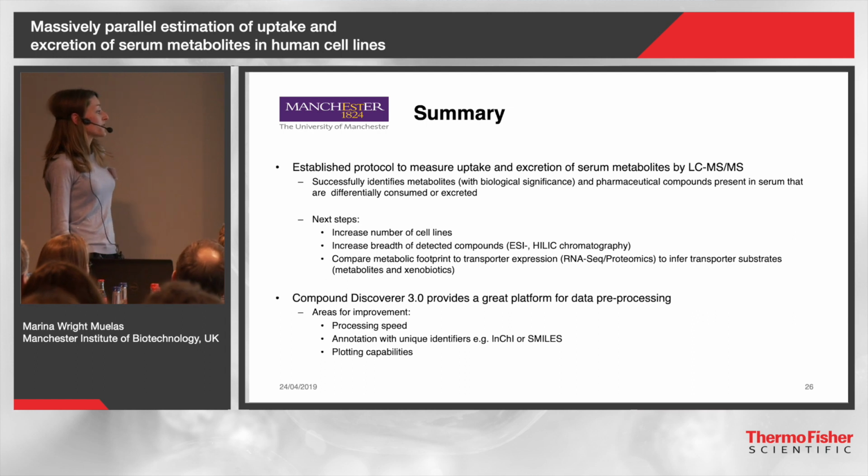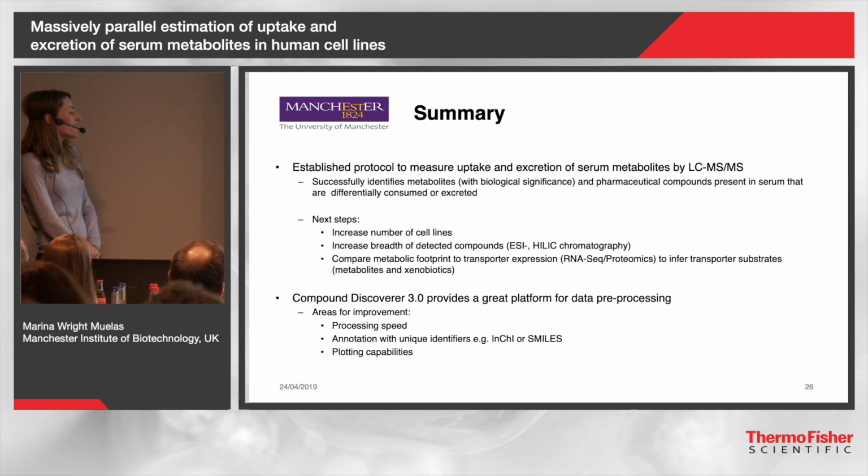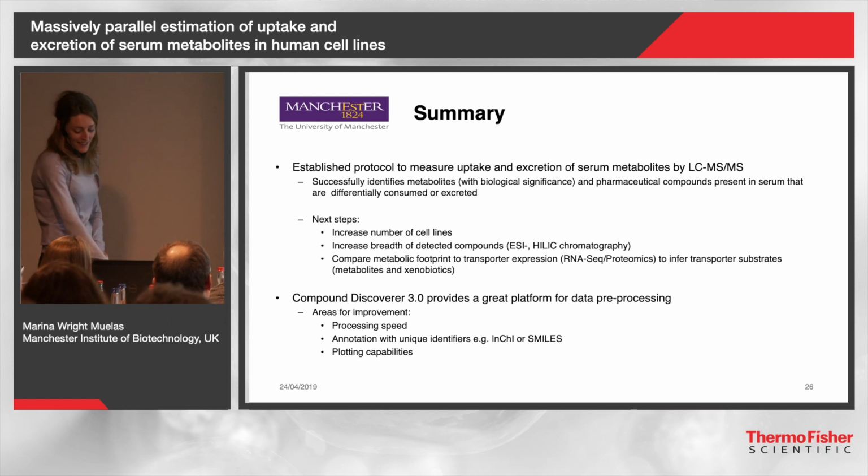And I find that Compound Discoverer is a great platform for the data pre-processing side of things. Like I said, could do with it being a bit faster, but there are limitations to this, as we discussed this morning. Really would like annotation with unique identifiers and some improvement on the plotting capabilities.